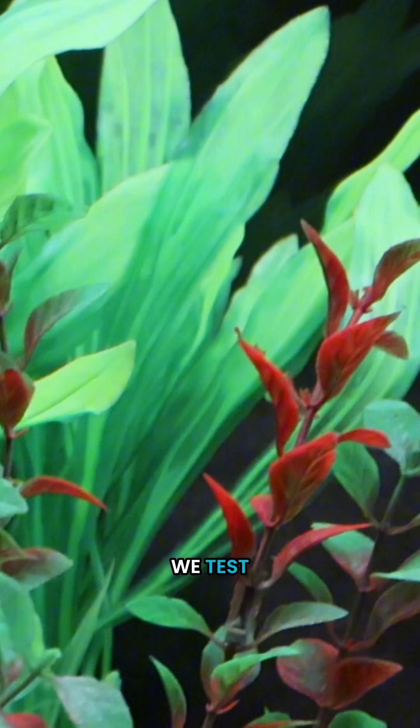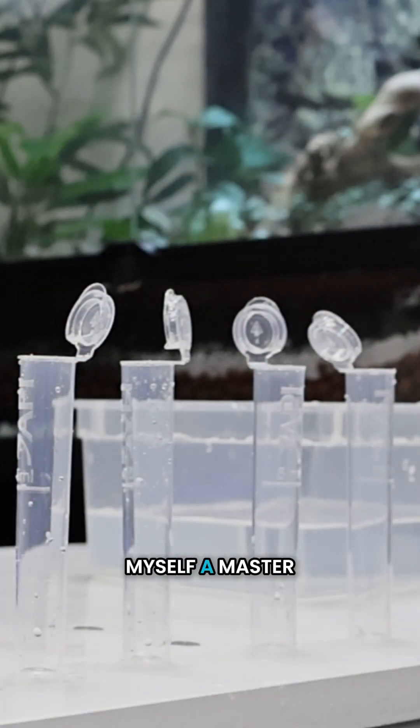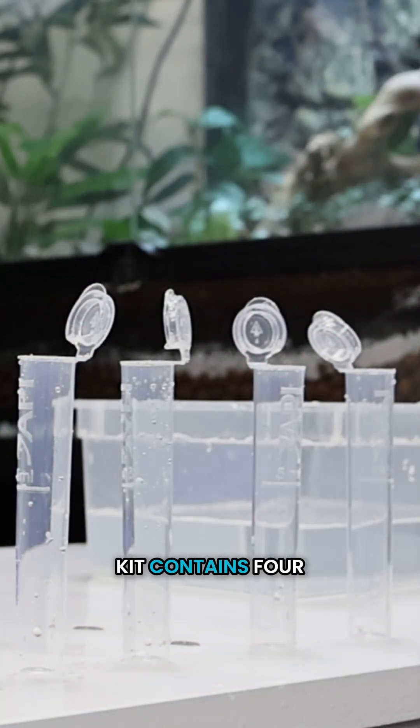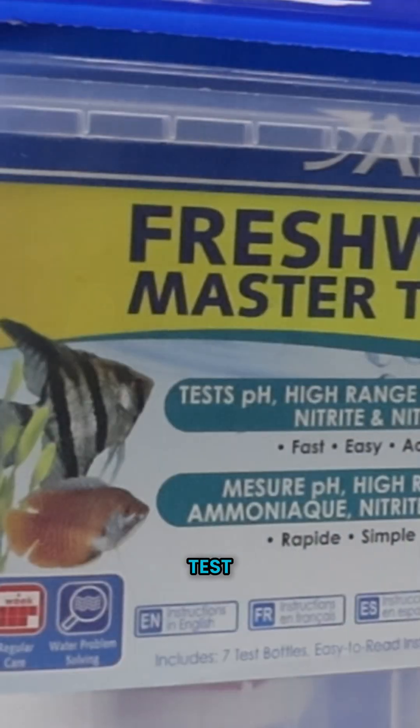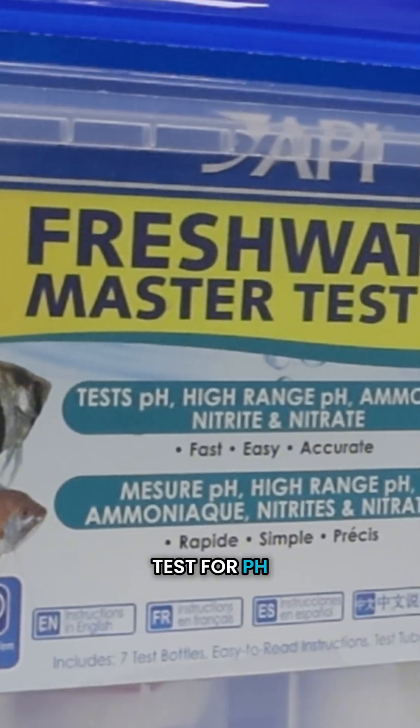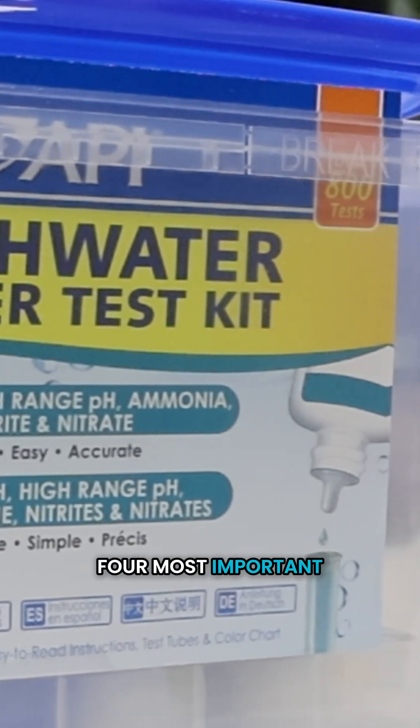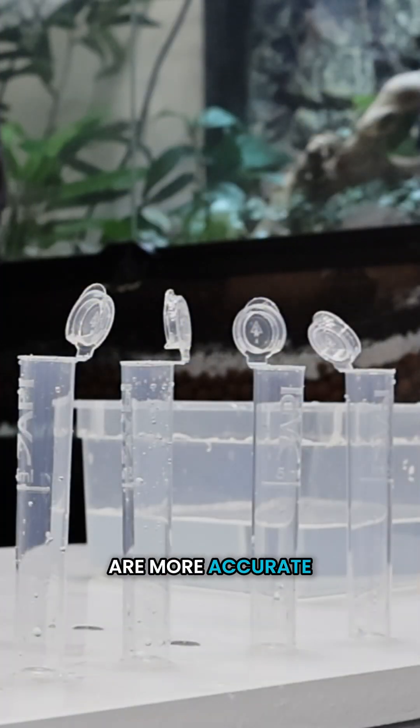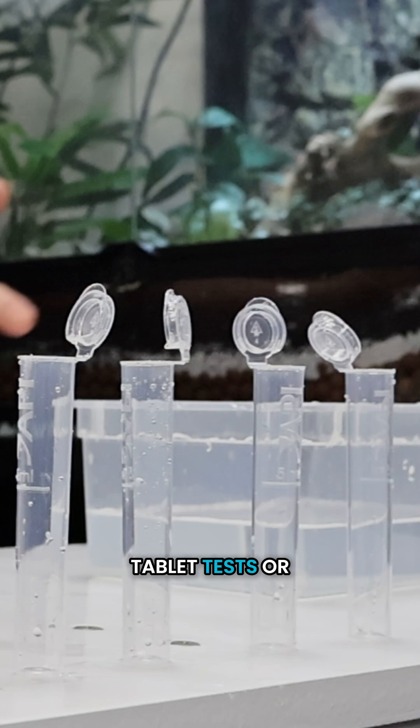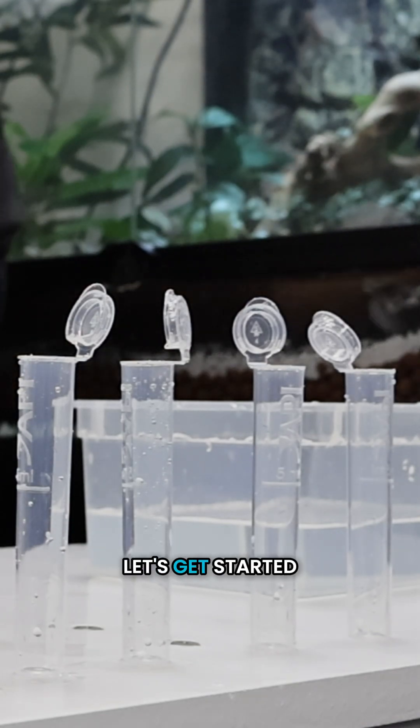That's why we test. So I've got myself a master test kit—a master test kit contains four or more tests—and this one tests for pH, ammonia, nitrite, and nitrate. Those are the four most important. Liquid tests are more accurate than tablet tests or dip strips, so I've gone for liquids. Let's get started.